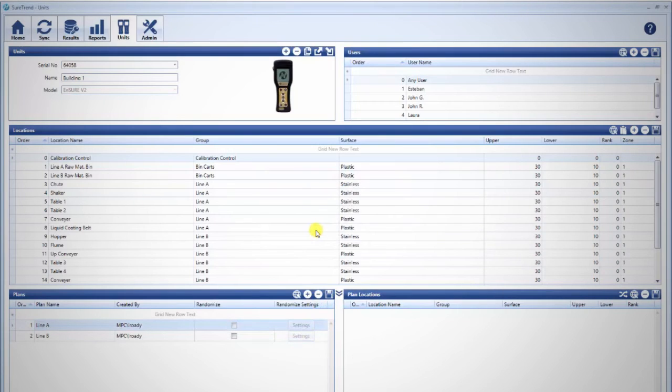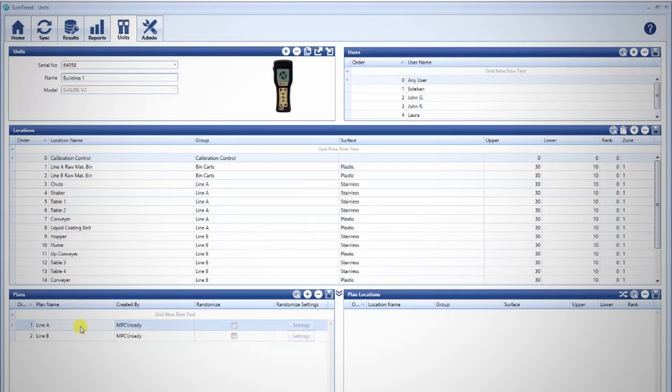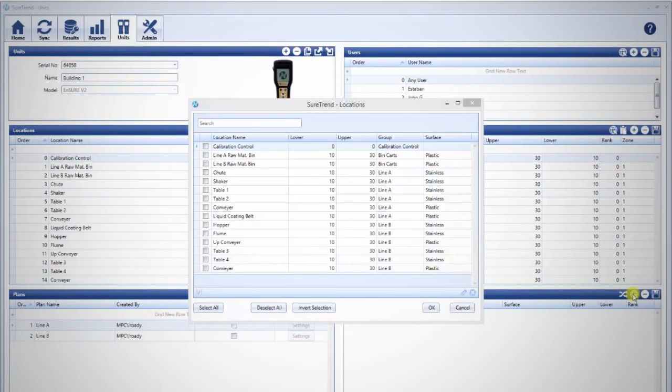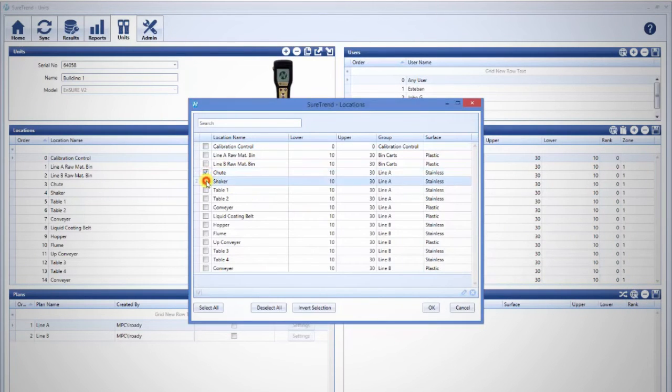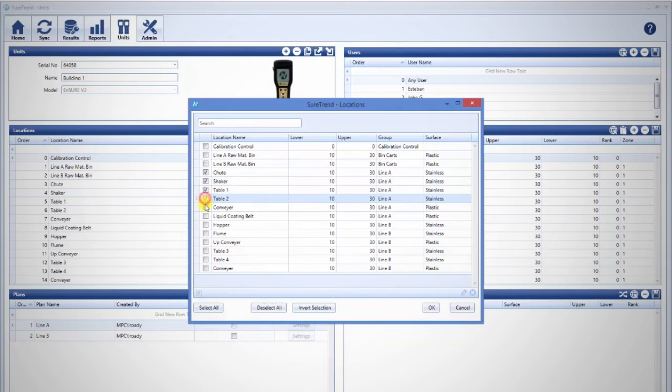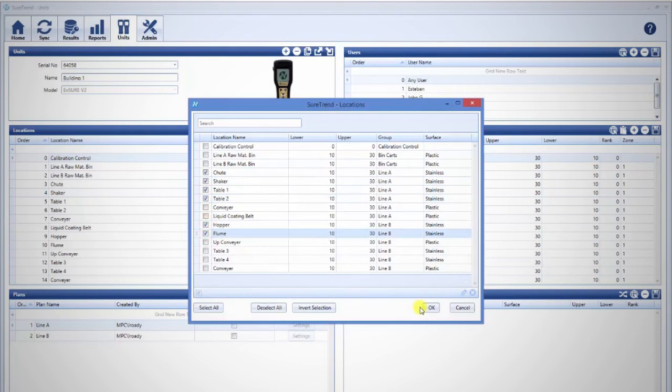Now you need to add test locations to the plan. First, select the desired plan you want to edit. In the pane to the right, plan locations, select the globe icon on the top right. This will open a window that will let you select locations for this test plan from the locations on this unit. Once you've checked the locations you wish to add to this plan, click OK.